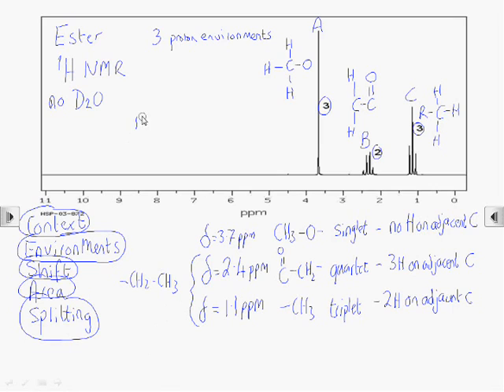So now we've got all the information necessary to map out the structure of our molecule. We've got methyl, and then the oxygen, then the carbonyl, and then an ethyl group. So this is methyl propanoate.